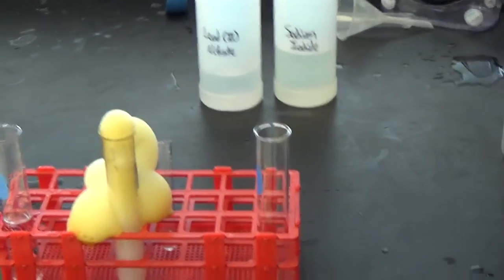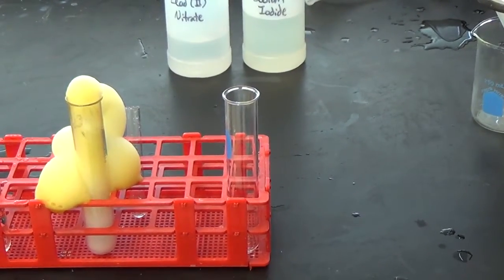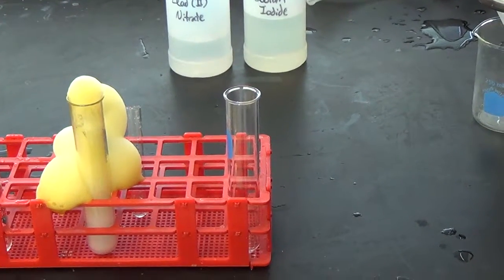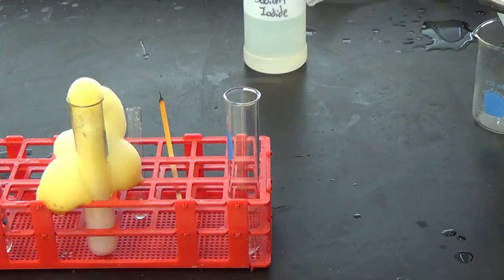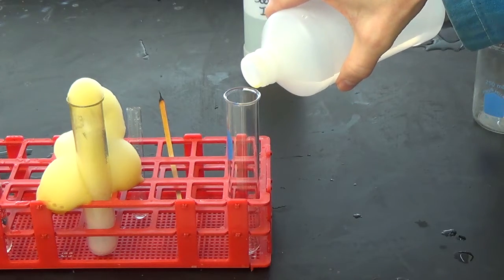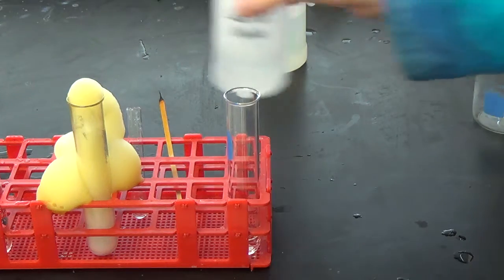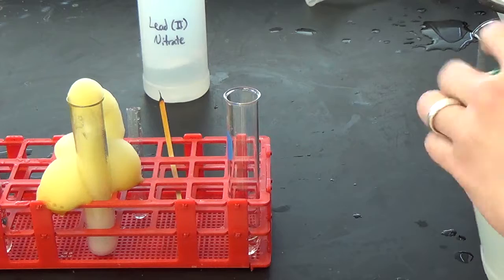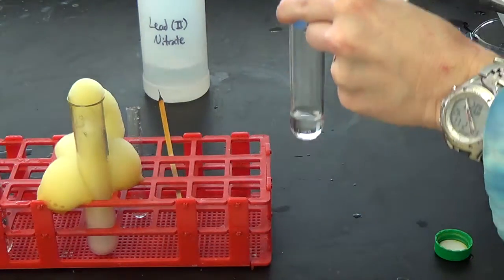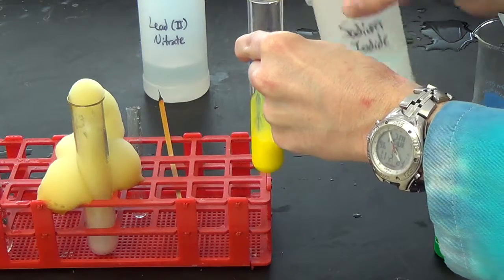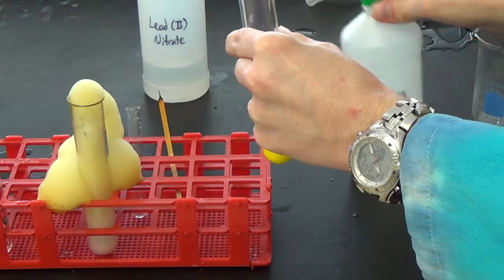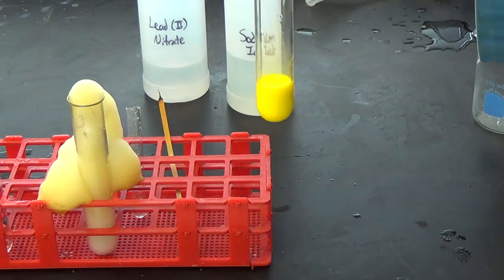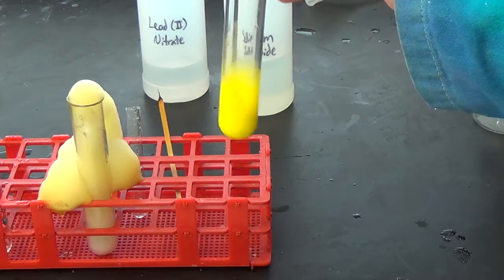In Reaction 5, I'm going to take these bottles. Lead 2 nitrate and sodium iodide. I'm going to mix them into this test tube. Here's a little lead 2 nitrate. Notice it's a clear solution. Here's a little sodium iodide. Again, a clear solution. I'll do this one out here so you can see. No longer a clear solution. Very dramatic color change. Why do we have that dramatic color change? And what is the products? You know the reactant, so I would expect you to be able to predict the products even now. But we're going to take this a step further.